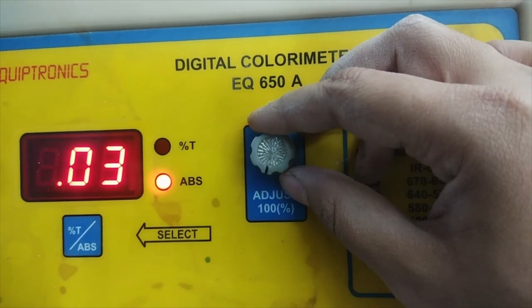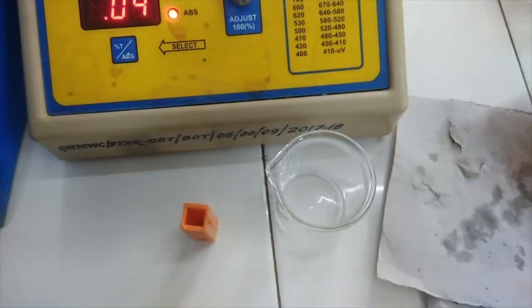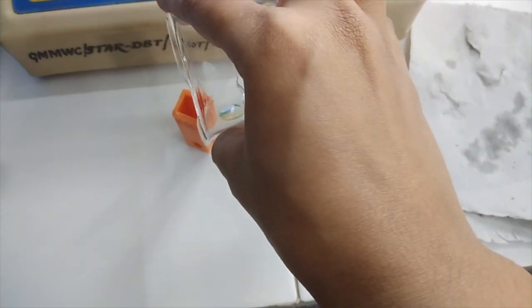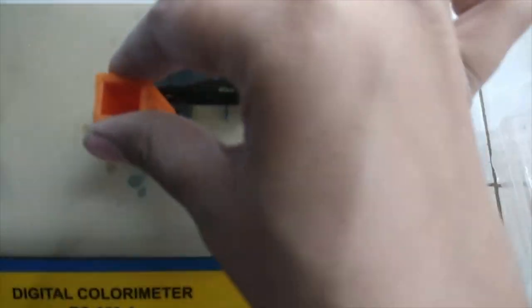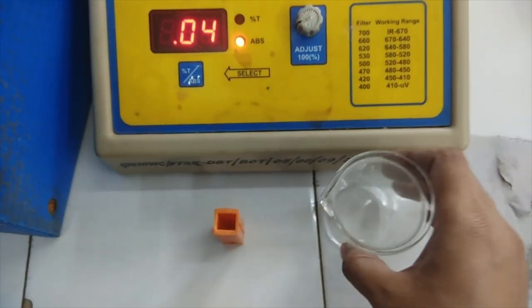Set the absorbance of distilled water at zero with the adjusting knob. First read the OD of blank, then standard, and then reaction mixture. Rinse the cuvette with distilled water after each reading.